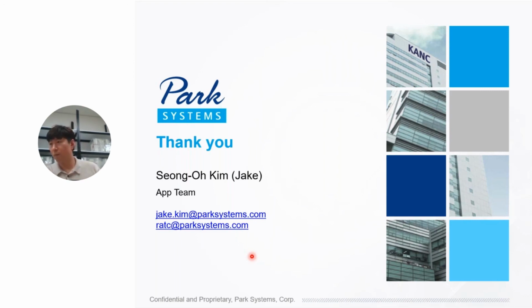Okay, looks like we have our first question. Regarding the true non-contact of the Park Systems, what makes it different to the usual non-contact mode measurement? Usual what measurement? The usual non-contact mode measurement. Regarding the true non-contact of the Park system, what makes it different to the usual non-contact mode measurement?